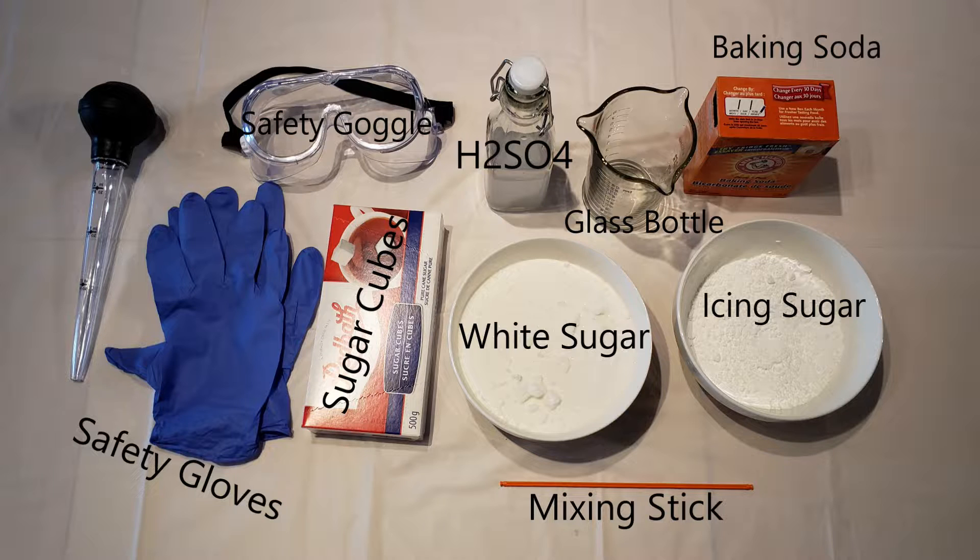Also, you will need sulfuric acid, a mixing stick, and baking soda. The baking soda is to neutralize the acid just in case something goes wrong.